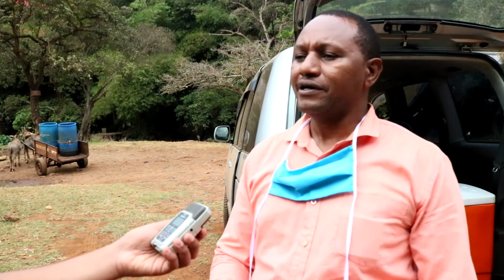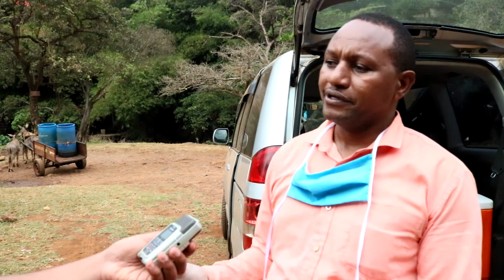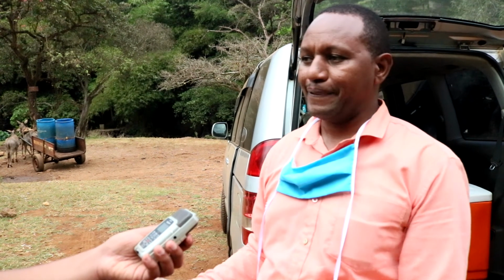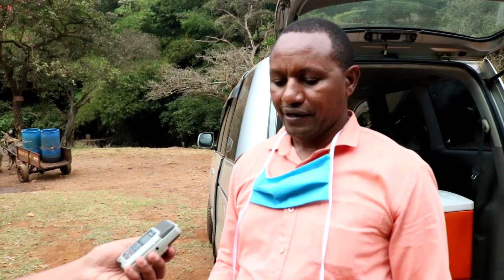Now what we'll do is that we are going to mix all these samples so that we can get 1 representative sample of what is being sold in the market. We'll take a carton, and then we put all these kales in the carton, and then we try to shuffle them so that we get uniformity from all the traders. And from that, we are going to pick 1 kilogram and put it in a sealable bag so that we can seal them. And before we do that, we have to weigh so that we are sure that we're getting 1 kilogram from all these 3 samples, which are well mixed. So we'll weigh the sample, make sure it's 1 kilogram.